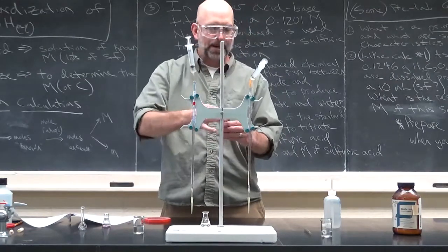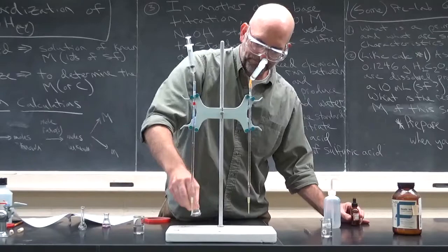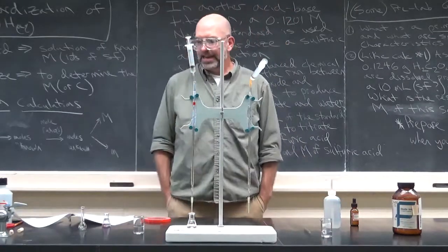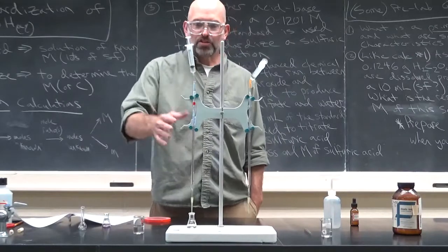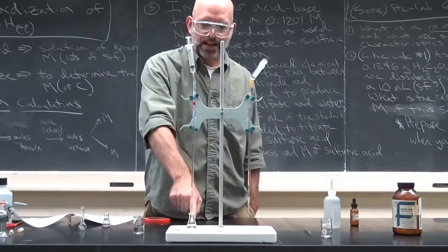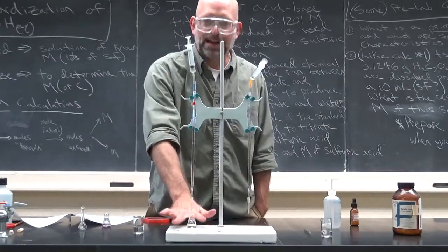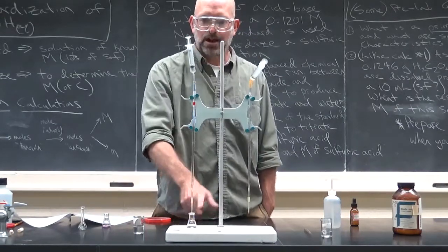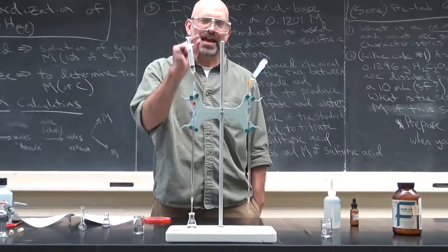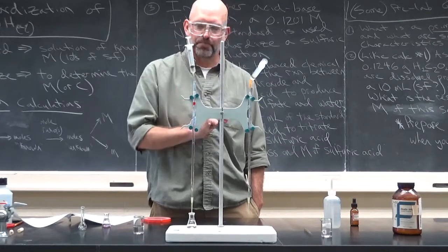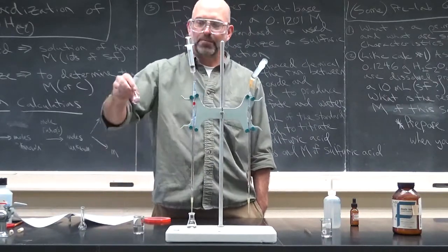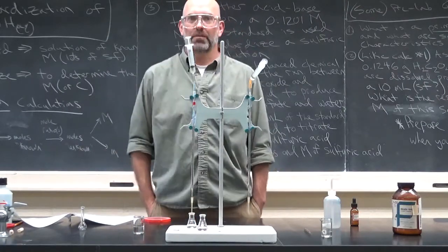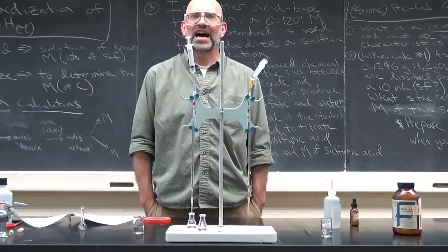It's not crucial how many. I'll put three drops in. One, two, three drops of phenolphthalein. Always put caps back on everything. Swirl it. Again, that didn't change anything. Now, it's also helpful, depending on which ring stand you're using, to make sure that the platform is white.